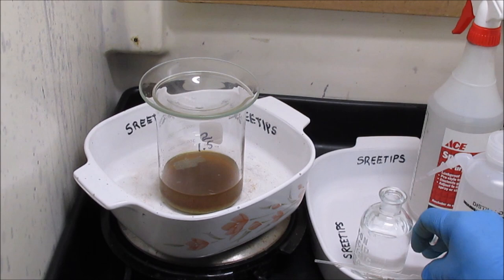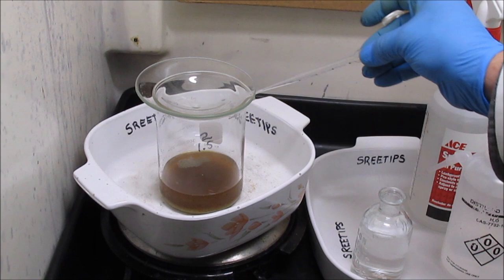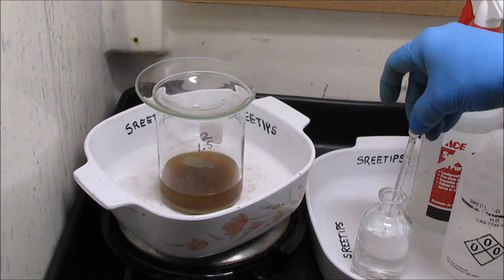What I'm going to do is go ahead and add some more nitric acid. I got 2 plus 1.5 in there so far. This is going to be about 1.5, another 1.5 mL of nitric going in right now.